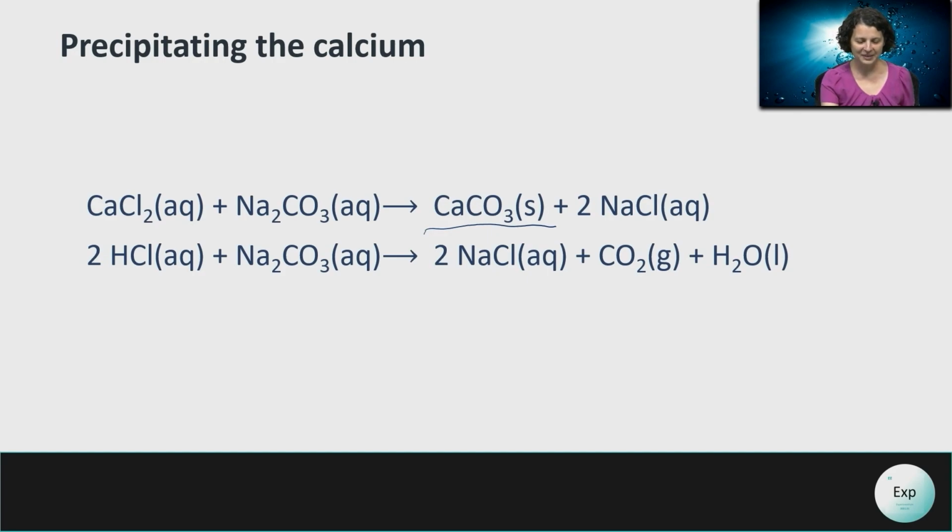In very old textbooks, you may find precipitates indicated with an arrow pointing down, showing that it is crashing out of the solution. Most of the time it will build up on the bottom of the beaker. You also have some leftover hydrochloric acid, since the hydrochloric acid was your excess reactant in the previous step. That also has to be neutralized, because otherwise you will have calcium carbonate and hydrochloric acid in the same solution, and those two will react again.